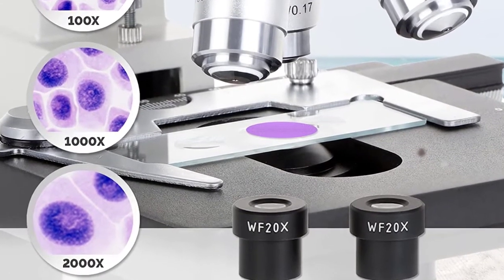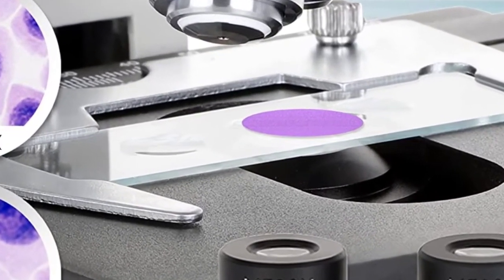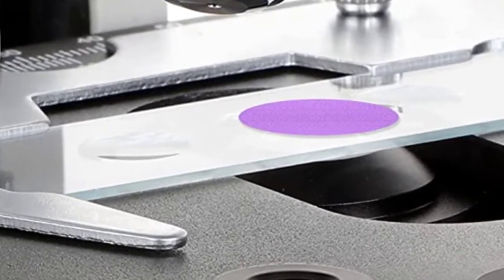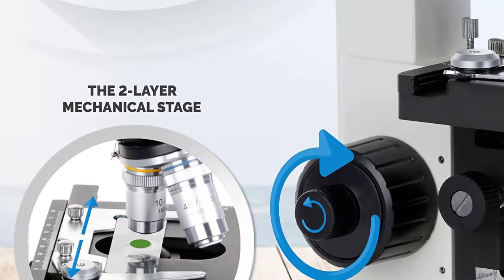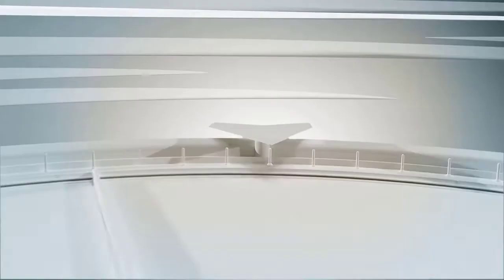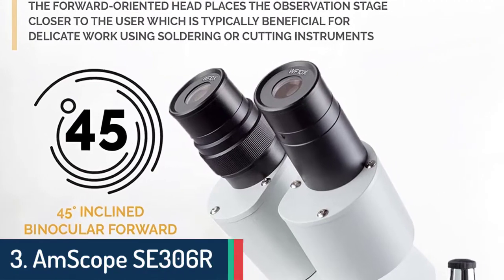Condenser: NA 1.25 Abbe condenser with iris diaphragm. Illumination: transmitted low LED light, intensity adjustable. Focus: coaxial coarse and fine knobs on both sides. Full solid metal frame construction with stain-resistant enamel finish. Power supply: AC/DC adapter 7.5V 7.5W, input 100-240 volts.